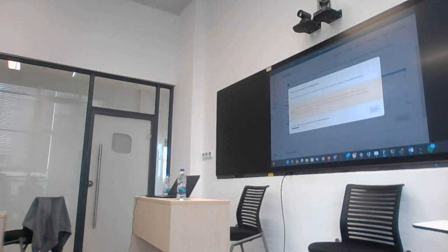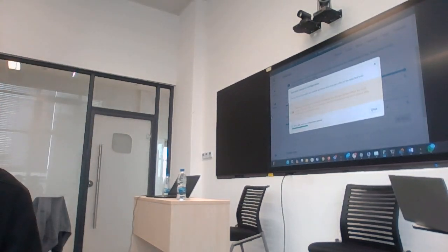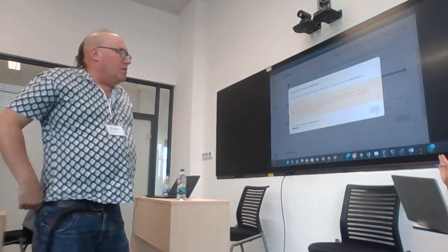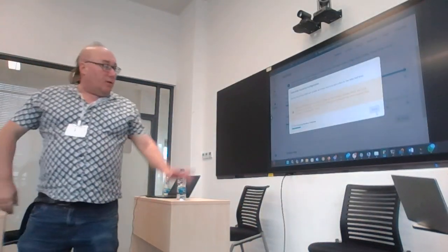Okay, you've got 32, so you've got plenty of RAM. You have 32 maximum, so how much RAM have you got? How is it 0 RAM? Can you make this one 2 gigs of RAM? Then 16 is enough for what we're doing today. So the default is 50%. 50%, yeah. So I'm just adding this to the docs. Yeah, thank you.